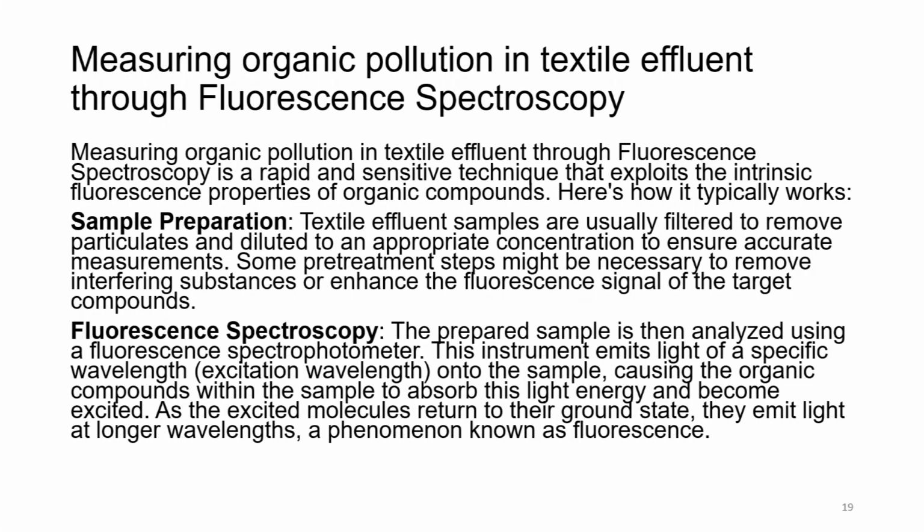Sample preparation. Textile effluent samples are usually filtered to remove particulates and diluted to an appropriate concentration to ensure accurate measurements. Some pre-treatment steps might be necessary to remove interfering substances or enhance the fluorescence signal of the target compound.